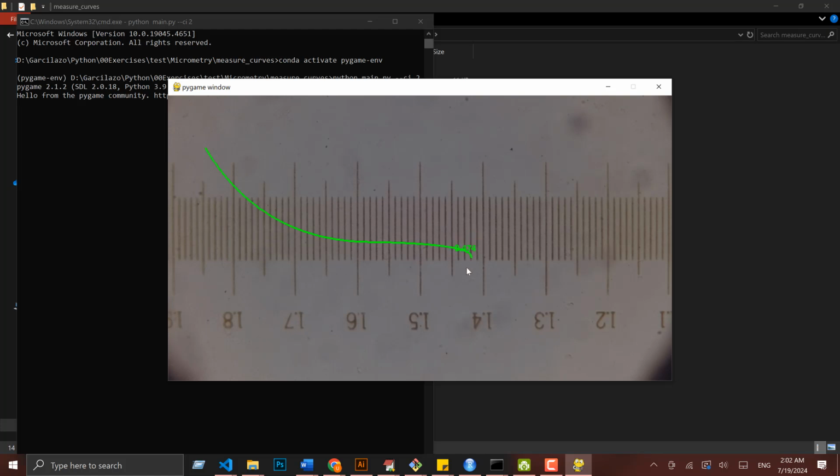Once I do that, if I hover my mouse around the screen, notice that a new curve has been created. This is now called a spline. The previous point where my cursor was is the new gravity point toward which my new curve is set to bend. So here, because the previous point was over here, that's why my curve is moving upwards. But sometimes I may not want that. So I can click here and repeat the process, and notice that the information has been corrected. So now I have complete control over the Bezier curve, just like with Illustrator and Photoshop.